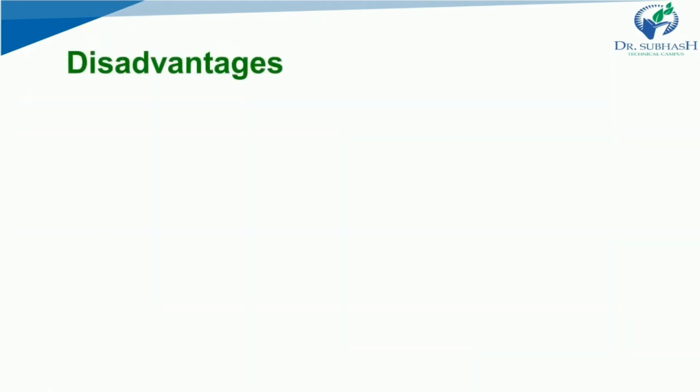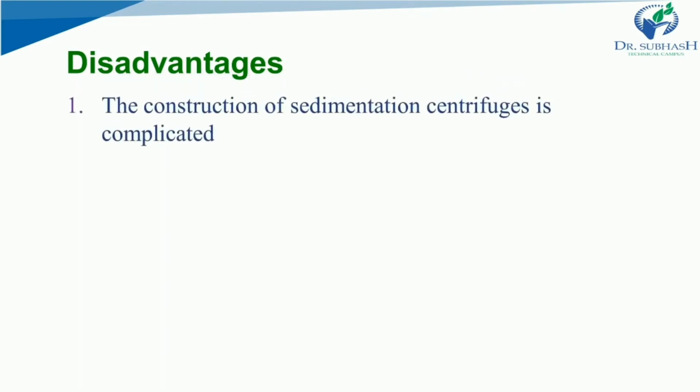Now, obviously there must be disadvantages. So the first is that the construction of a sedimentation centrifuge is complicated. Second, its capacity is limited. These are the most important disadvantages which any person who selects the centrifuge has to keep in mind, that the capacity is limited.